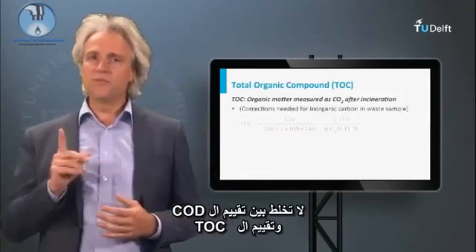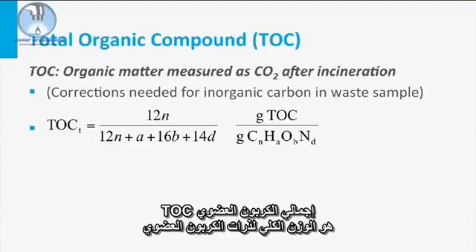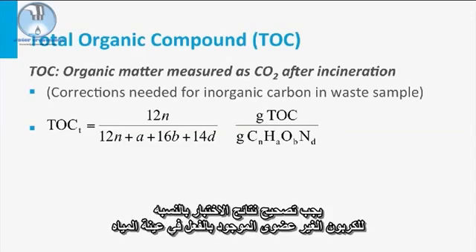Be careful, don't mix up the COD assessment with TOC assessment. TOC stands for total organic carbon, which is the total weight of organic carbon atoms relative to the weight of the organic compound. In this test, all carbon is incinerated, after which it's measured as CO2. Test results must be corrected for inorganic carbon already present in a water sample.